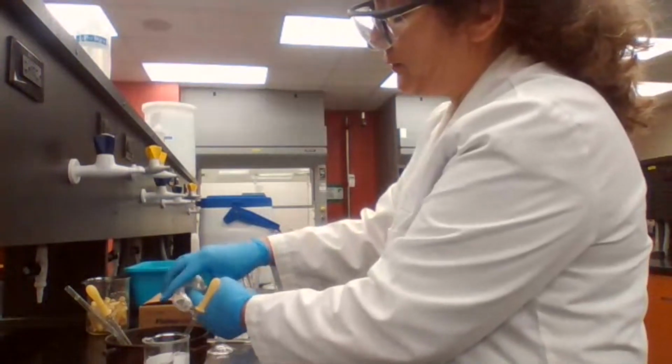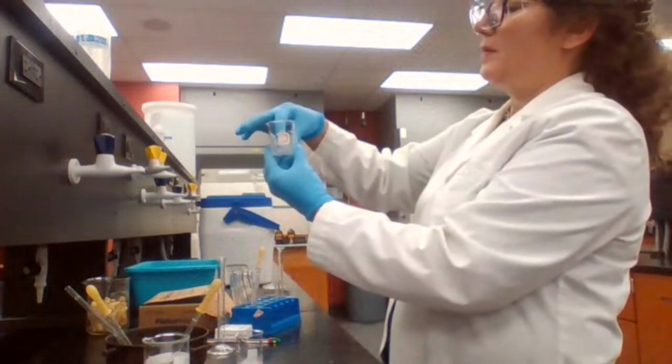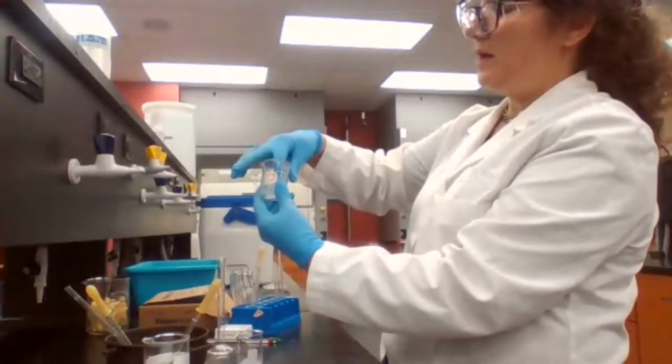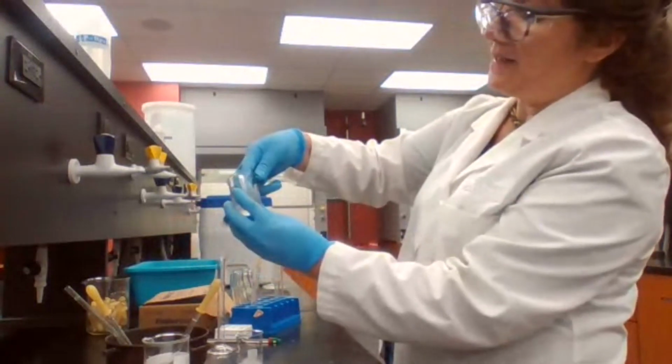I'm going to try the first test tube, or the first reaction mixture, using ice in a 50 mL beaker up to the mark of 10.